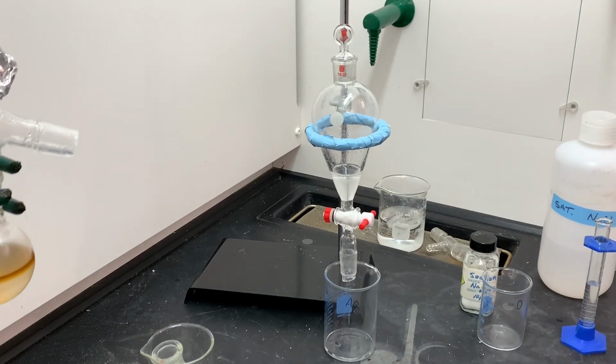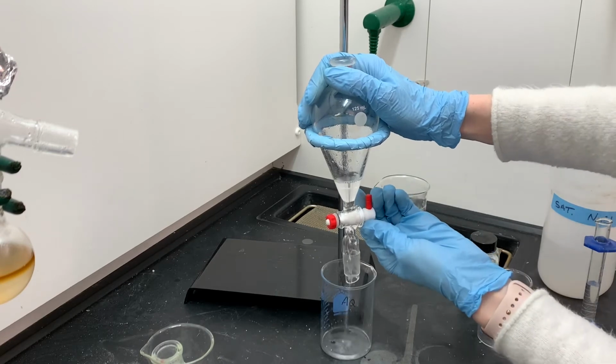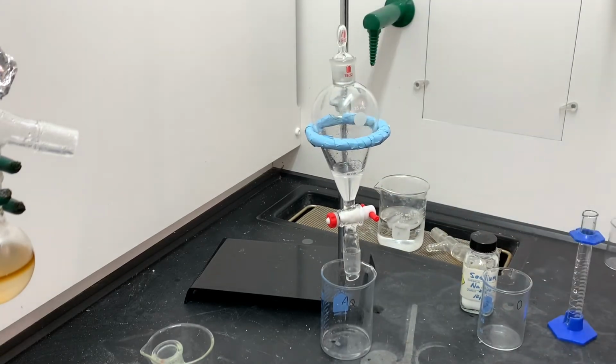The bottom is saturated sodium chloride and any waste that we're removing from our product. So I'm going to drain that bottom layer again, get all of it out. Look at that nice clear product. This is another rinse with saturated sodium chloride, same volume.